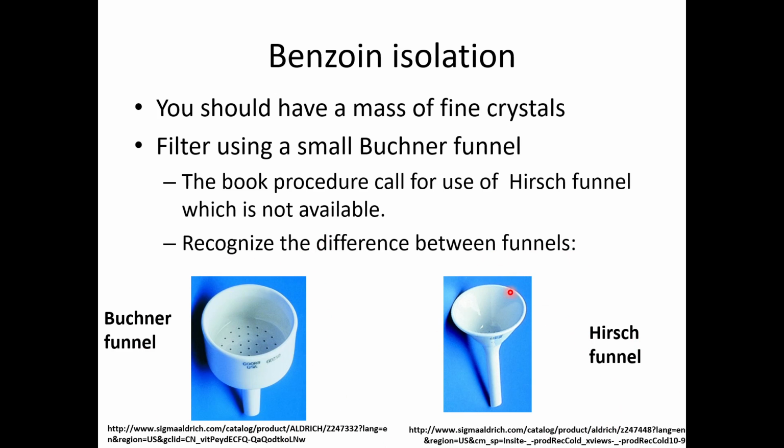They put a comparison here, so you don't use the Hirsch funnel. This is not used for this experiment. You need to use the Büchner one.